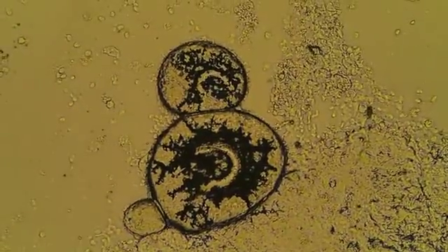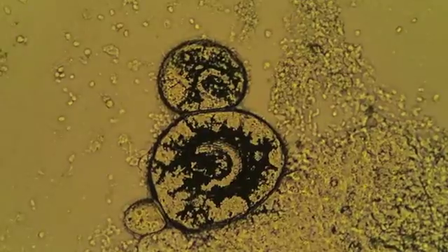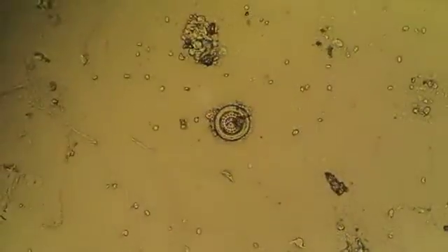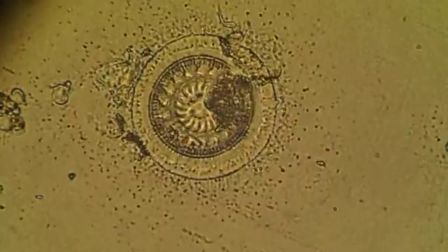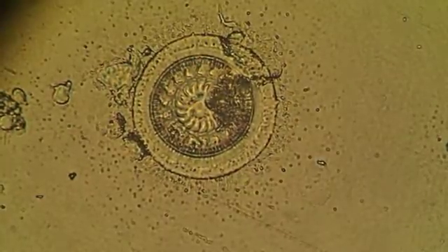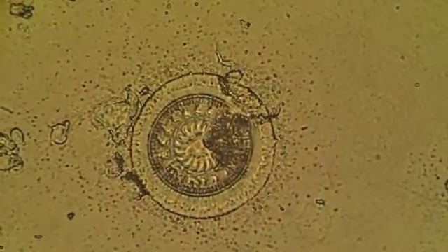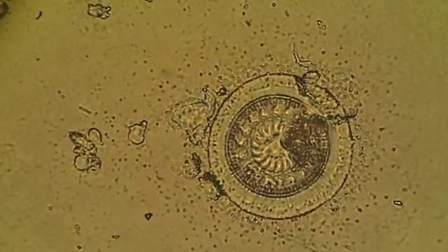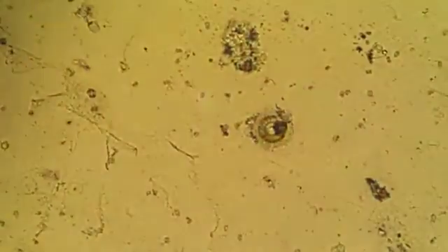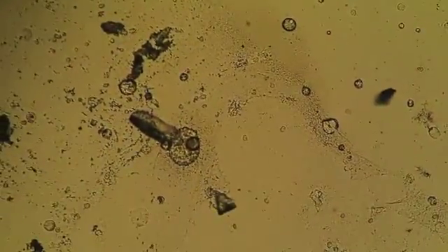Two of them there with the horse shoe shaped nucleus. This is actually Trichodina. You can see the denticular ring in the middle — looks a bit like the spokes of a bicycle. These are ciliated protozoa known as Trichodina. But they're not primary pathogens.